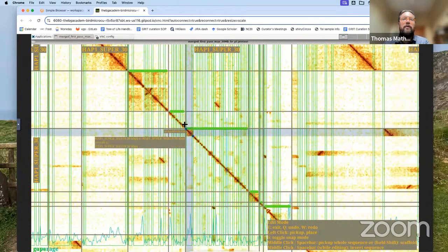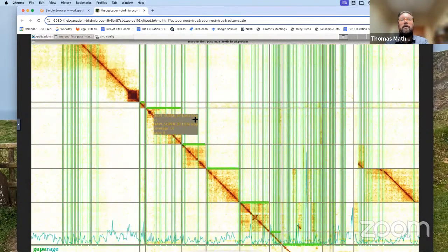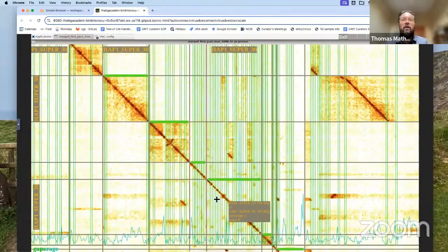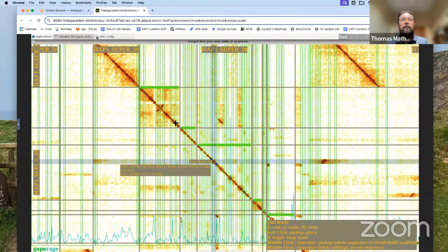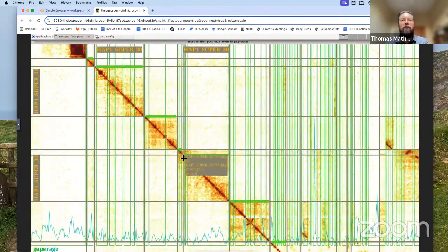So here's another chunk. So move it to the beginning. And so we're just gradually building up the first haplotype, just with units which might be candidate chromosomes. And we can see along this bit of the scaffold, there's various bits. So this bit, for example, has a high background with this bit. I'm going to pick it up, place it, and it looks like it belongs at the beginning of this chunk here. You see the higher contacts here than at the other end.